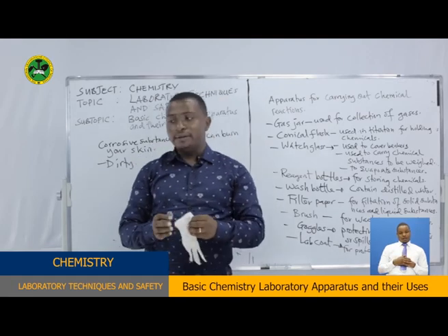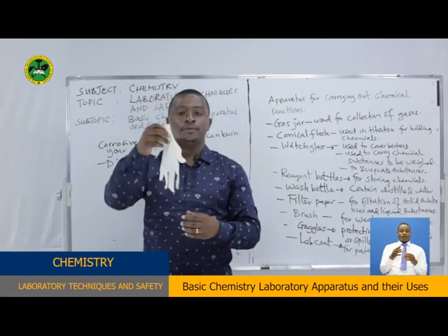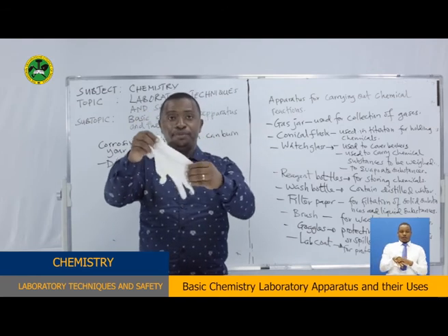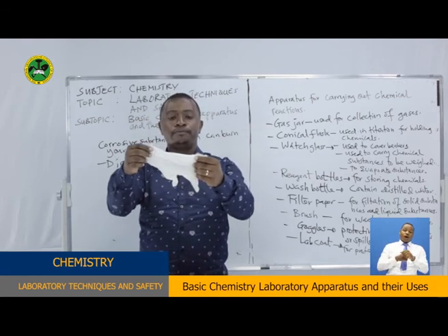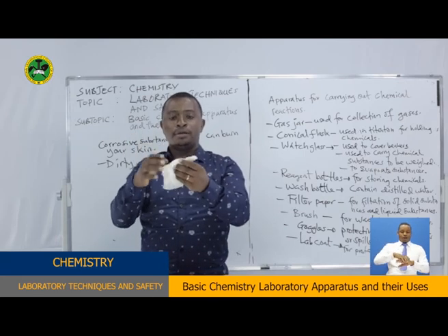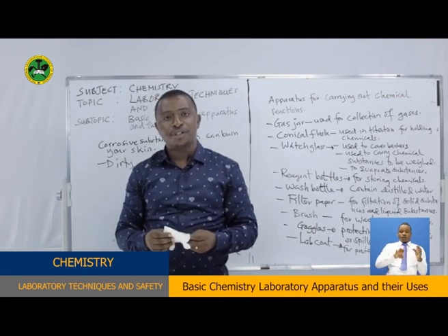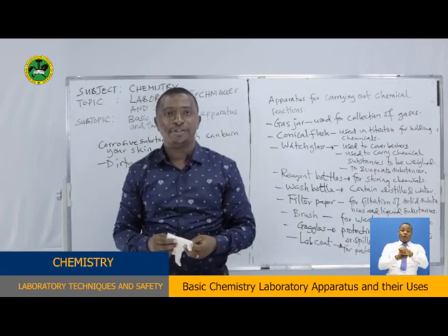But lastly, we have some gloves, hand gloves. These are worn while performing an experiment. So it is used to protect hands from being contaminated with harmful chemicals or toxic chemicals during an experiment.